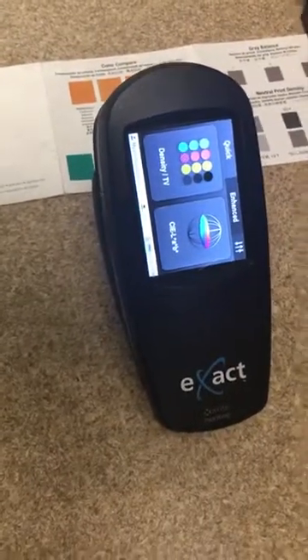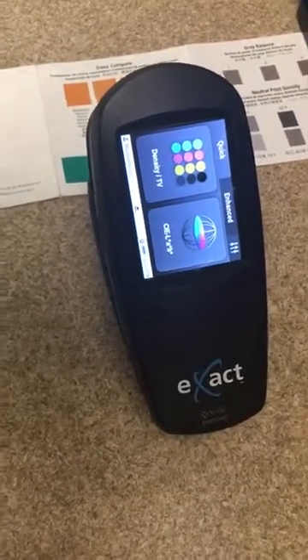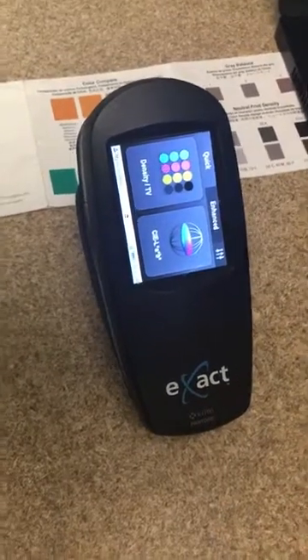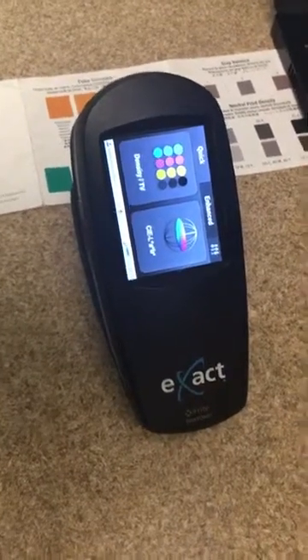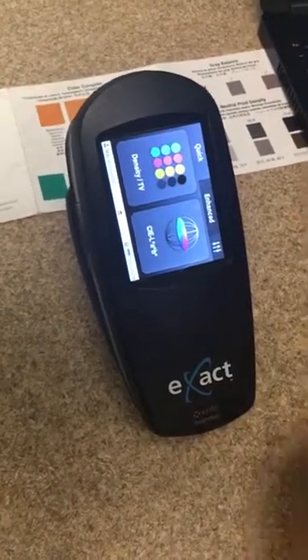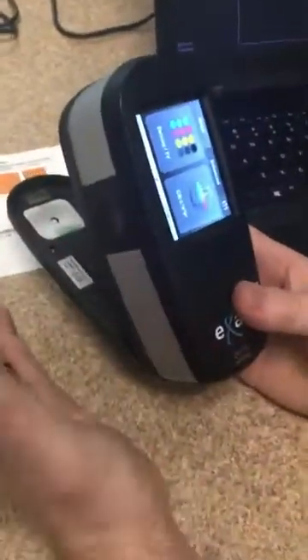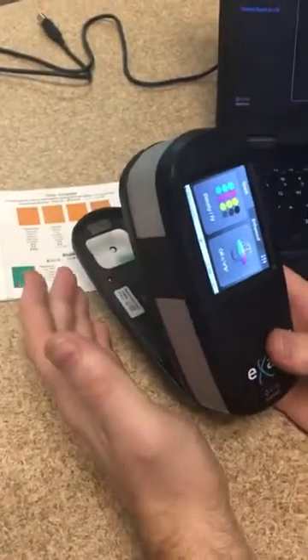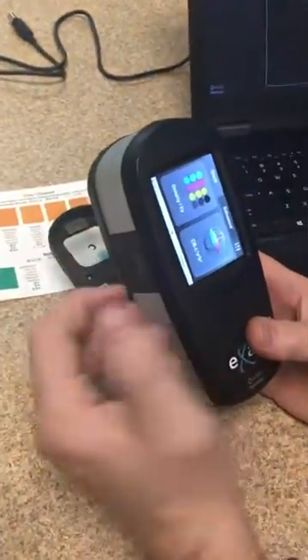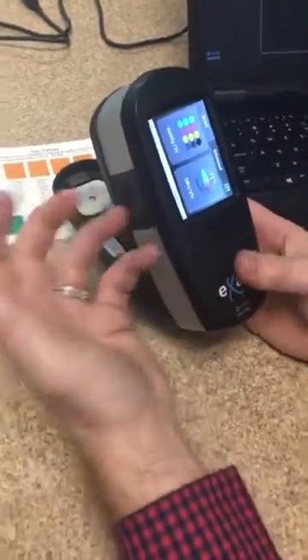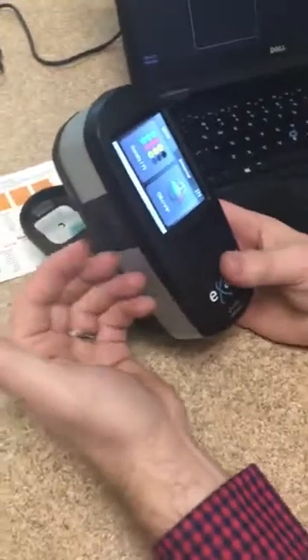I'm back with Scott Herrick from X-Rite Pantone, who's going to walk through the interface of the X-Act and some of the tools that you can bring to your workflow. So first off, we have basically three versions of this. We have a Basic, which is just a densitometer version — it doesn't have the LAB and the spectral engine or spectral data coming out of it.